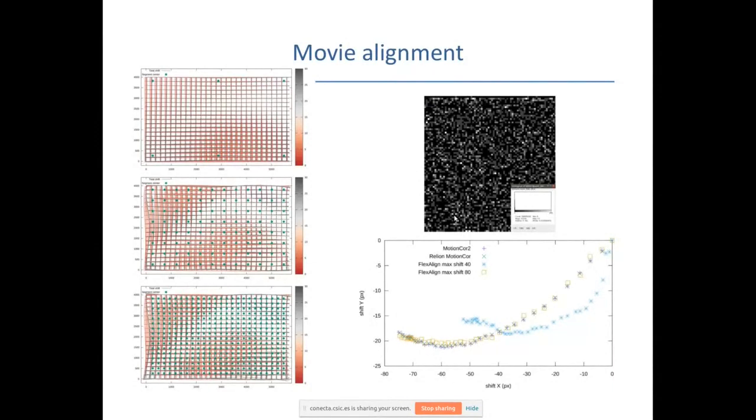And then you have to find the alignment between all possible pairs of frames. It depends on the algorithm how they work, but this is a reasonable way. The thing is that all these shifts will have a lot of noise, so the algorithm must have some robust way of identifying which shifts are incorrect.